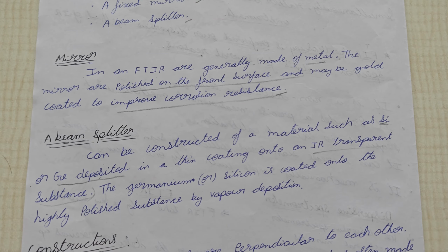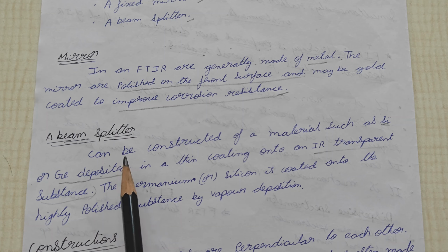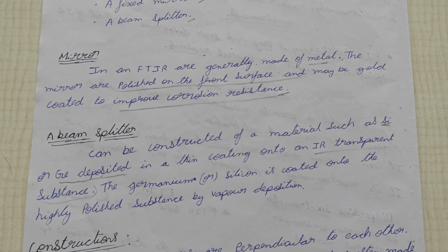Again, by the word only you can write the instrumentation. The beam splitter splits the beam from the radiation source.